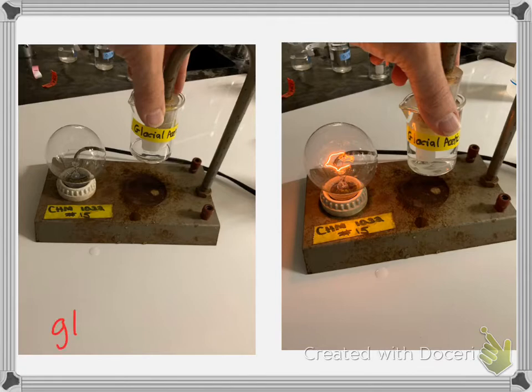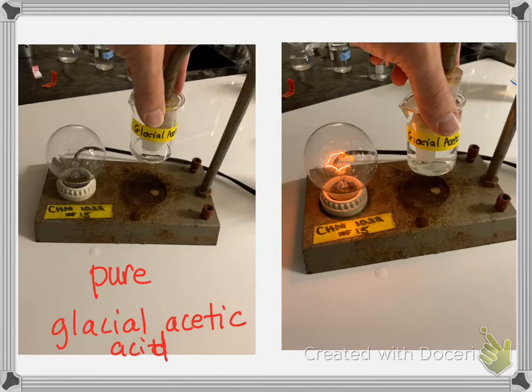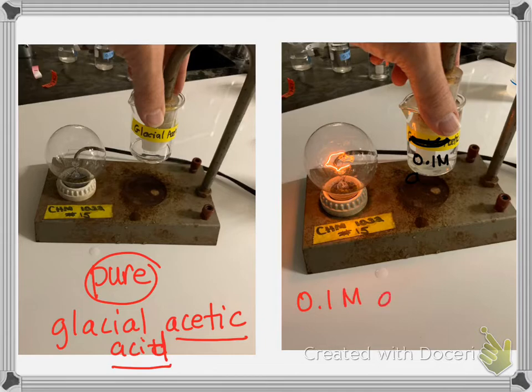This is glacial acetic acid, and this is pure. Acetic acid is the acid that's in vinegar, and glacial acetic acid is pure. Now this one, the label should read 0.1 molar acetic acid. And what you have to do to get a lower concentration is add water.